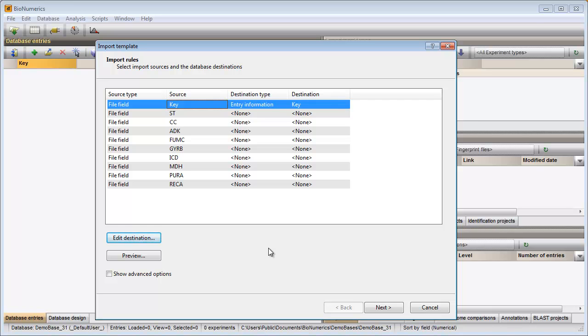Further, I would like to write the content of the sequence type and clonal complex columns to new information fields in my database.